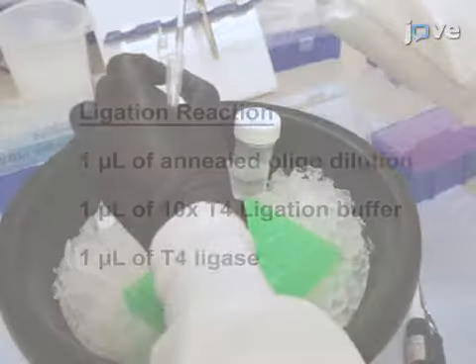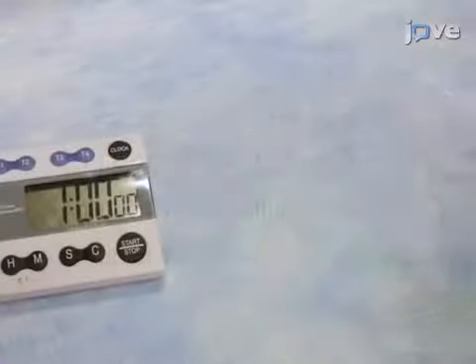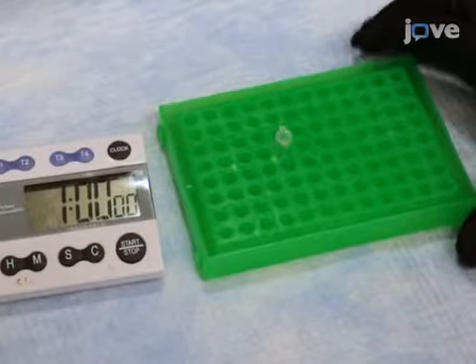To prepare the ligation mixture, add 50 nanograms of digested backbone and other reagents to a PCR tube kept on ice, and adjust the volume to 10 microliters with water. Incubate the reaction at room temperature for 1 hour.